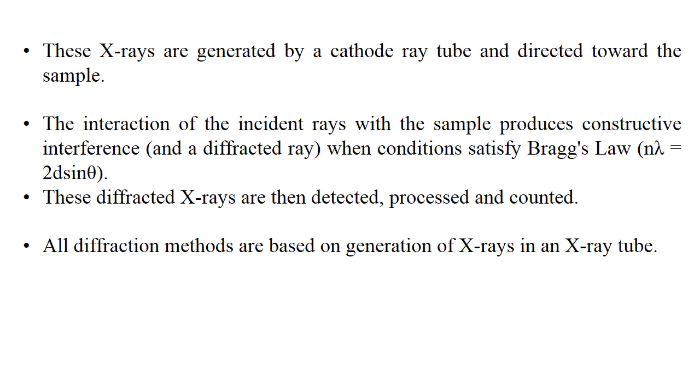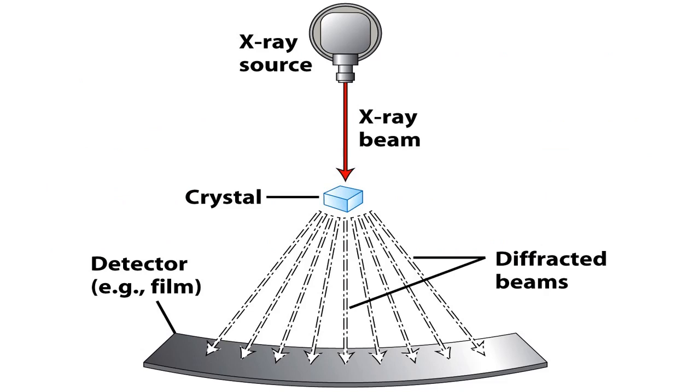All diffraction methods are based on generation of X-rays in an X-ray tube. This is the phenomenon and schematic diagram showing the X-ray diffraction technique.